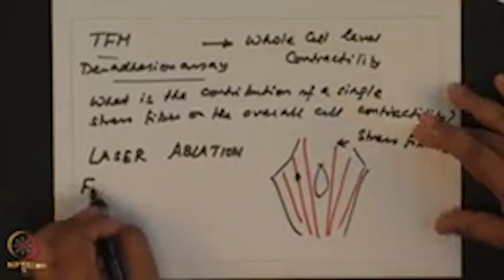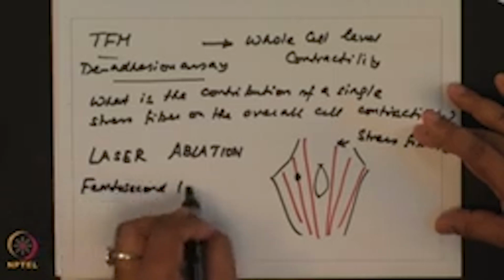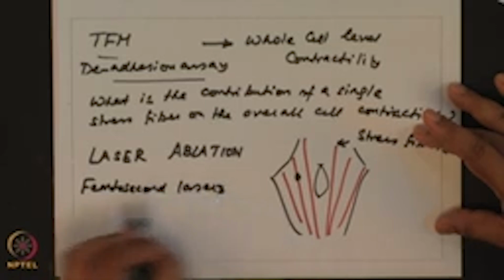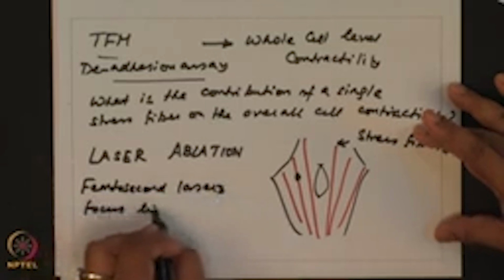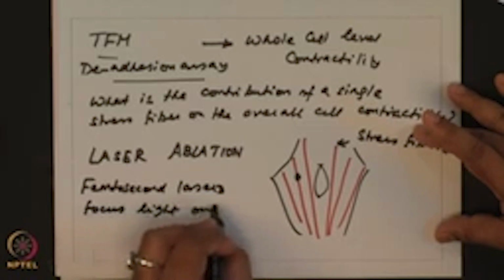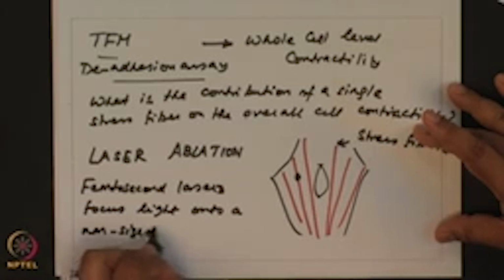So, using femtosecond lasers, you focus light onto a nanometer sized intracellular target.